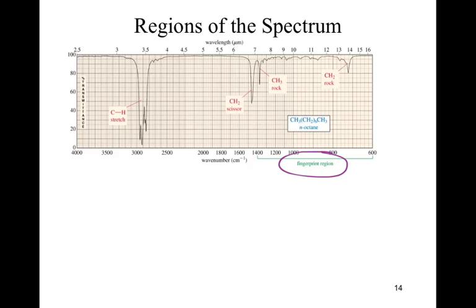Okay? Typically, they say it ranges up to 1400. If you ever watched me, which you will watch, analyze IR spectra, I typically ignore everything in that 1600 and lower range. Okay? The only reason I'll go into that range is if I have some more information about what my compound is to see if that bond could potentially show up in that range. Okay? So until I have that information, I ignore that area. Along the lines of ignore all those little words. We don't care about that.